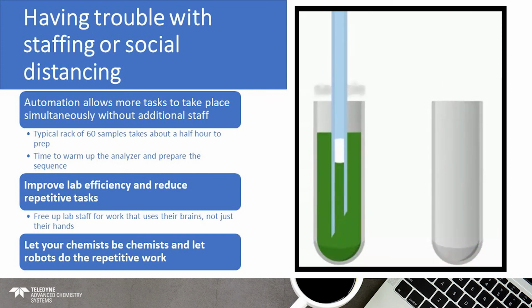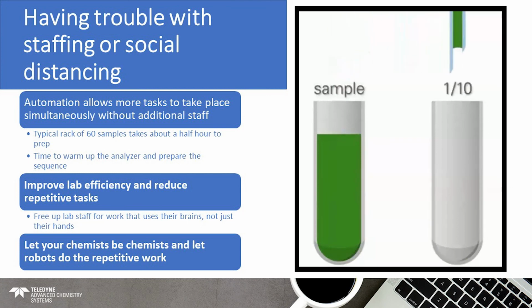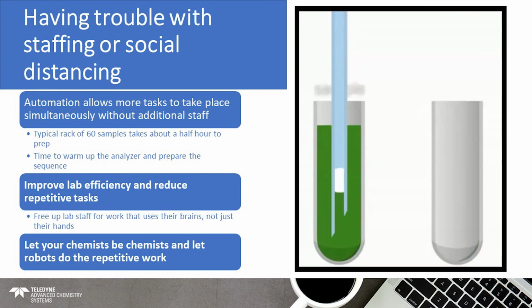And maybe what you do then is, all right, now I pour up the next set of samples. As soon as these ones are done diluting, I put on the next rack, I get those going, then I put those on the ICP, right? And the really nice thing about it is you no longer have to have someone else do more.